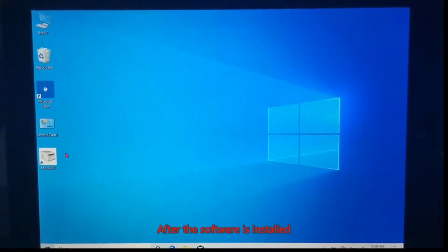After the software is installed, create a new environment, run the instrument without reagent. Check whether the instrument is normal. After confirming that there is no abnormal operation of the instrument, the experiment can be started.